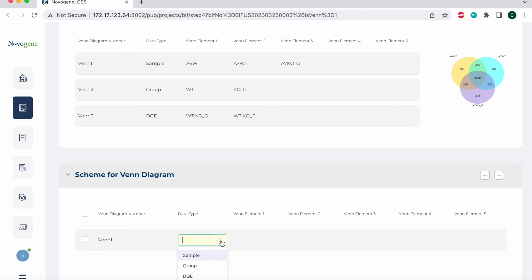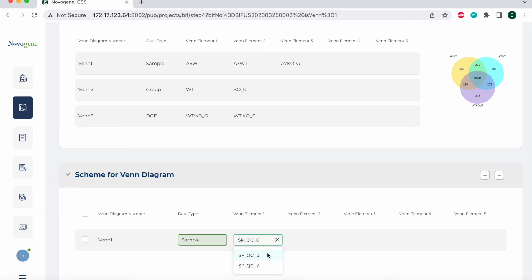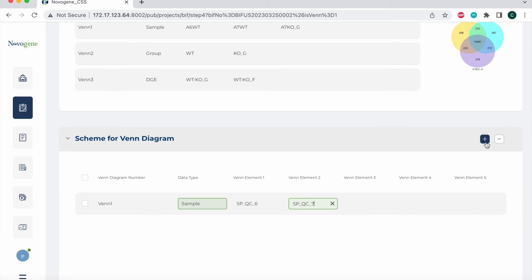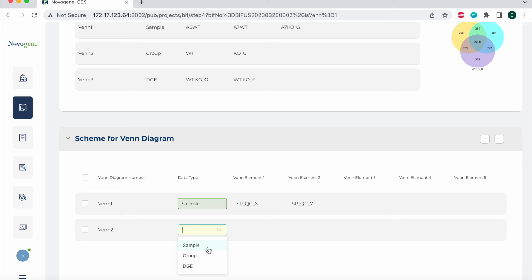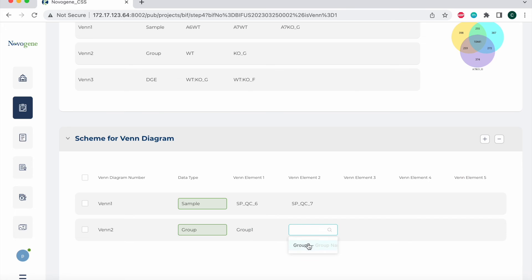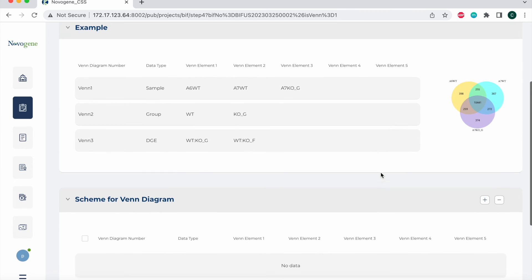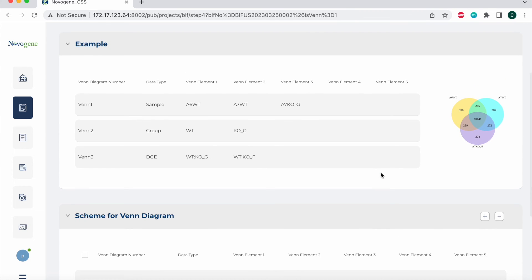I'm going to select the data type. In this example, I'm going to use samples. Then I'm going to add the relative samples that I would like to have a Venn diagram drawn for. I could do the same thing again by adding another row, selecting a different data type. In this example, I will use group and then add the relative group names I would like. If you do not want any Venn diagrams done, you can go ahead and delete all entries and submit this section without filling it out.